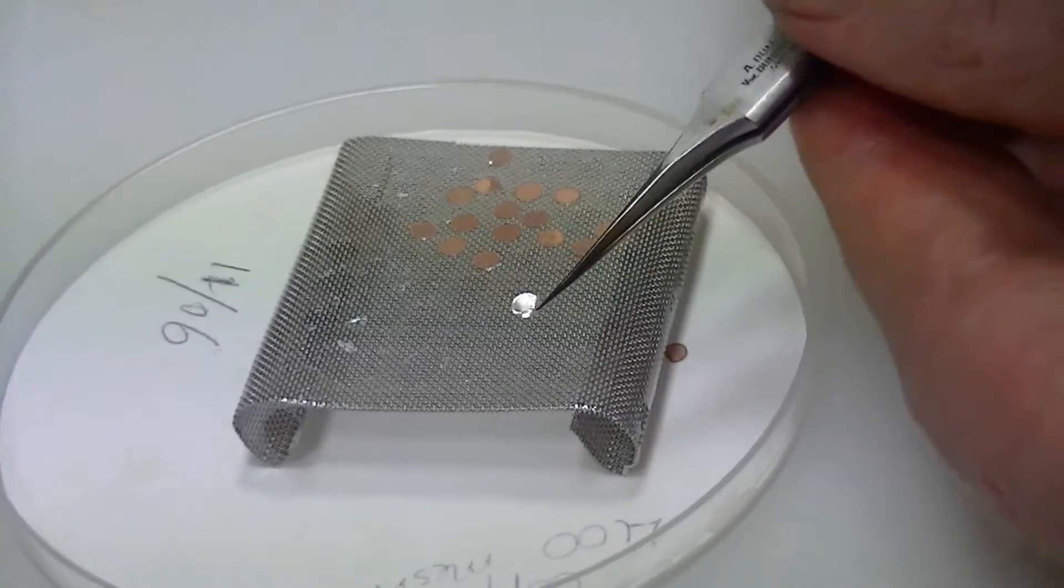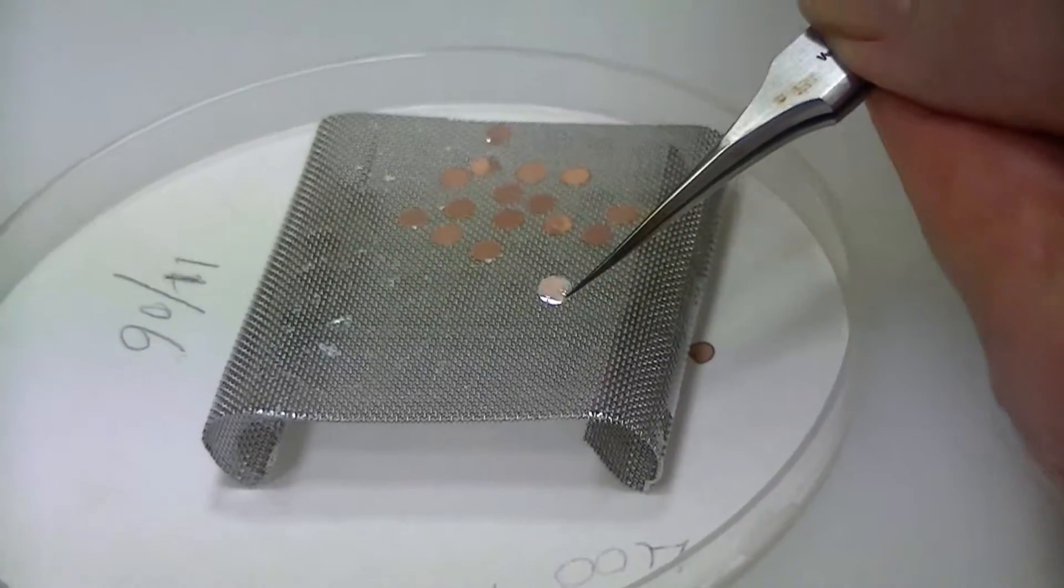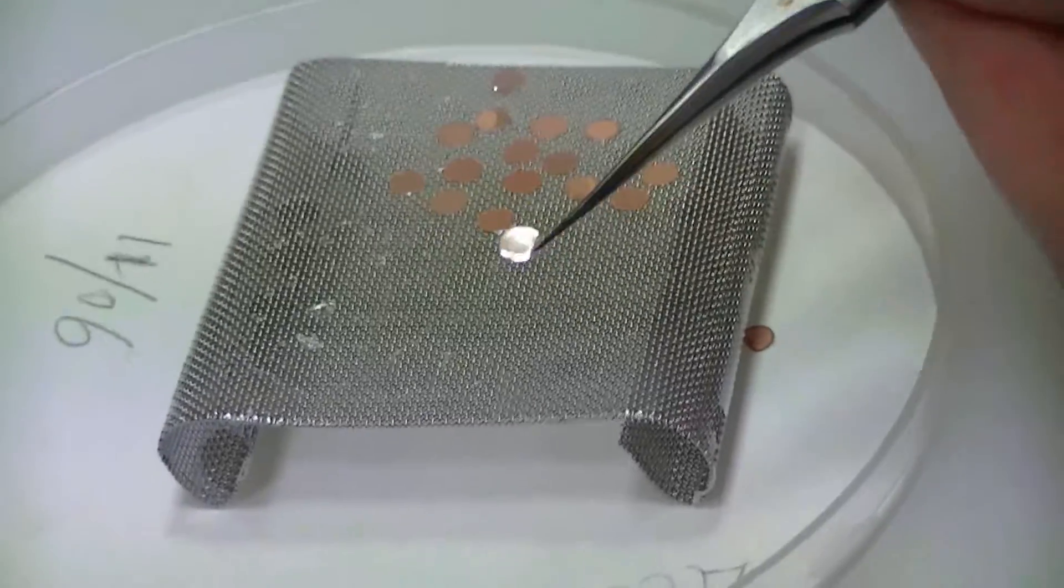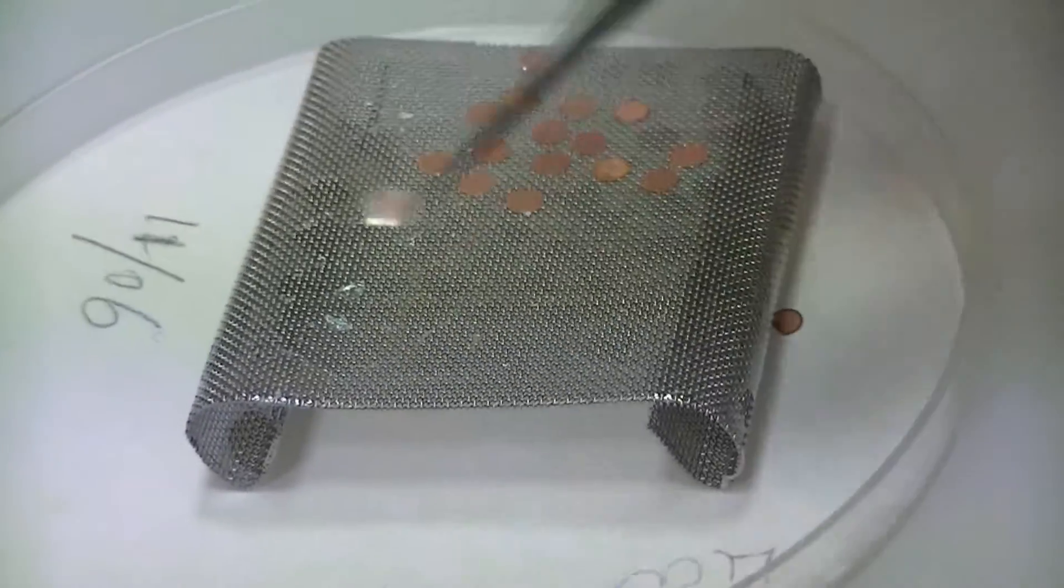The copper grid has been coated with plastic film and then carbon coated on top of that to make it conductive. We have to use forceps to hold the grid.